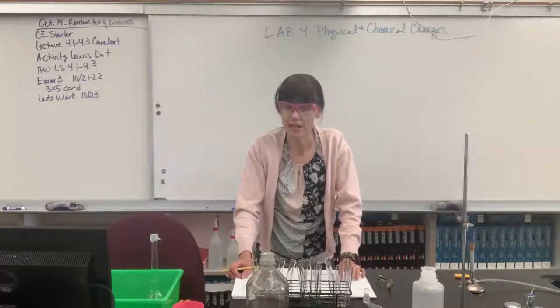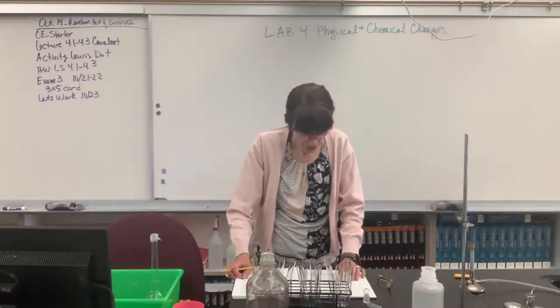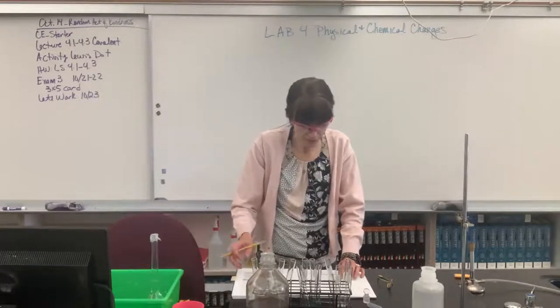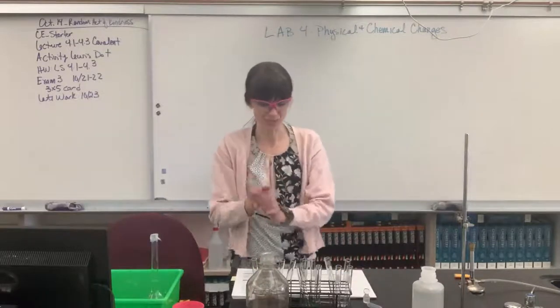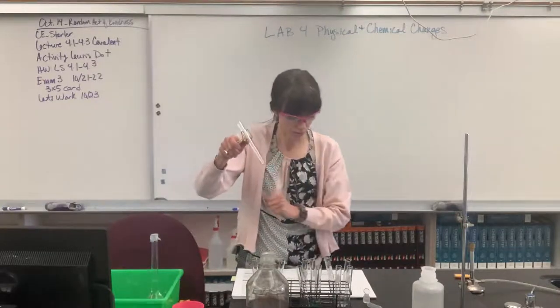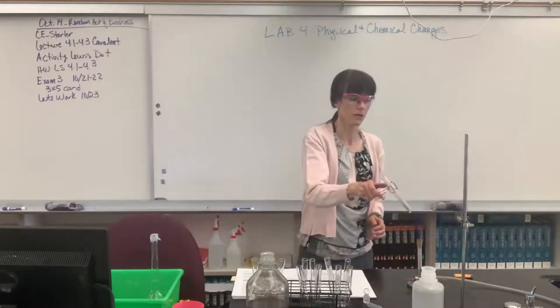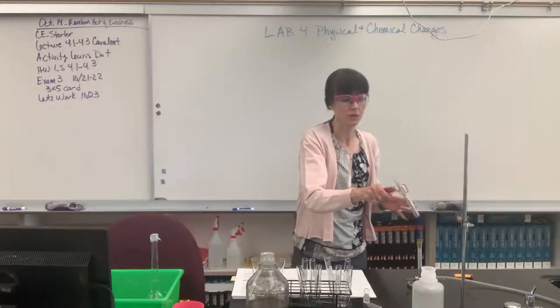Now, number 7. It says heat the other solid sample very gently just until it melts. This is best done by moving the test tube back and forth. I'm going to use my test tube holder. And here is our solid iron 3 chloride. We are going to put this over our Bunsen burner. I'm just going to move it. I'm trying to melt it.